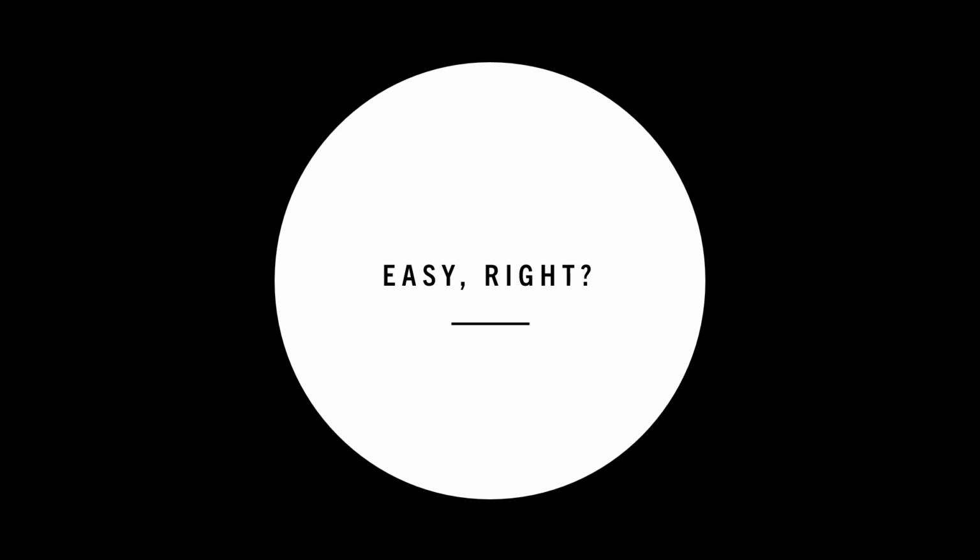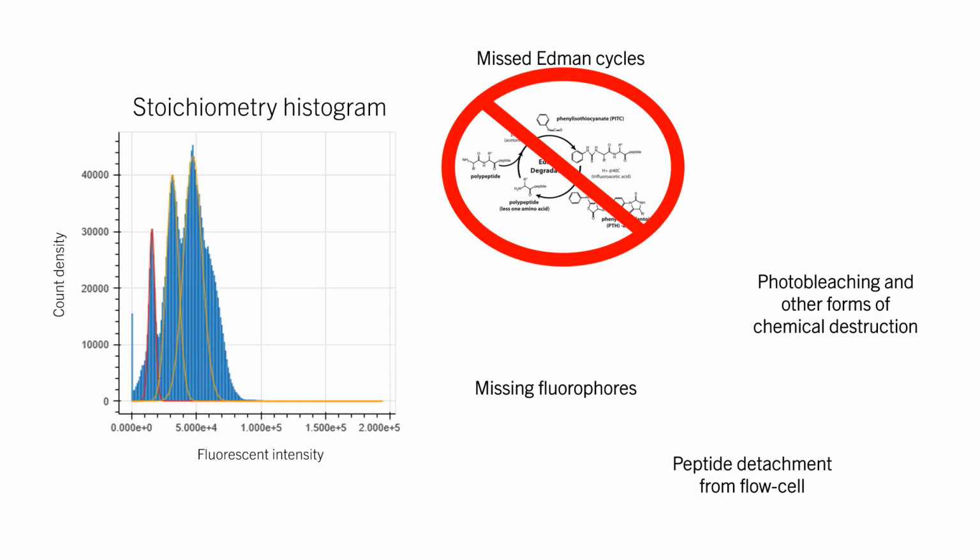So this may seem easy at first. It's not. This is a histogram of intensity values, and here we've done a fit of a mixture distribution for different numbers of fluorophores. You can see that there's a lot of overlap, which means we don't really know exactly how many fluorophores are at any point in the image at any point in time, so this is a little more chaotic than we'd like.